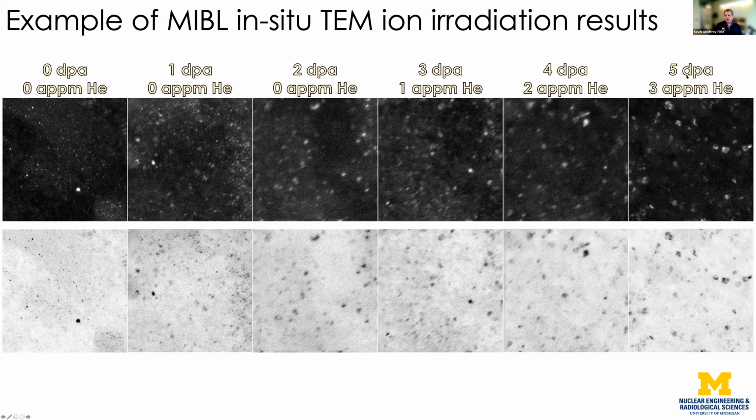A typical light water reactor would have a DPA of about 16 for the fuel elements in it. TerraPower wants to run their structural materials to 200. So this is just a fraction of that. But what you're seeing here is that we believe the precipitates are coarsening, and then we're also getting the defect or dislocation loop production.